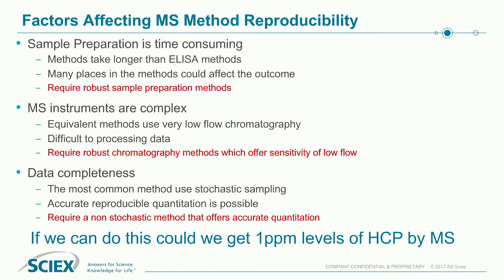So when we started to think about this, we started to think about all the factors that can affect mass spec reproducibility. So it's not just the instrument itself. It's not just the mass spectrometer and its robustness. It's around the sample preparation. It's around data completeness. It's around the chromatography. So we've been investigating ways of improving sample preparation, which we know is time-consuming for mass spectrometry. And so the question was, could we reintroduce robotics into the sample preparation, allowing many more samples to be generated with better robustness than manual procedures?